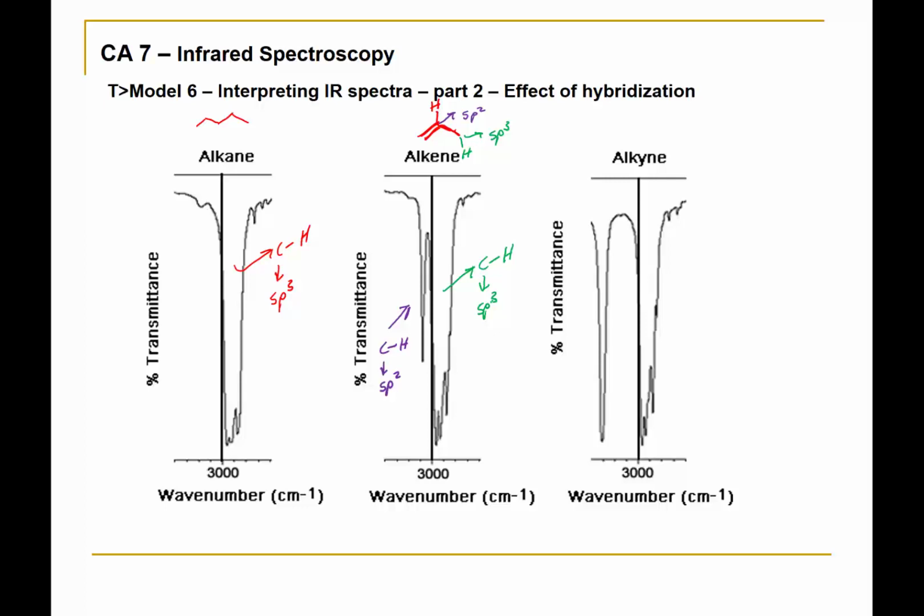Actually, what's more telling is when this peak is missing, because it's rather rare to have a structure, a molecule, where there are no sp3 hybridized carbons bonded to a hydrogen.